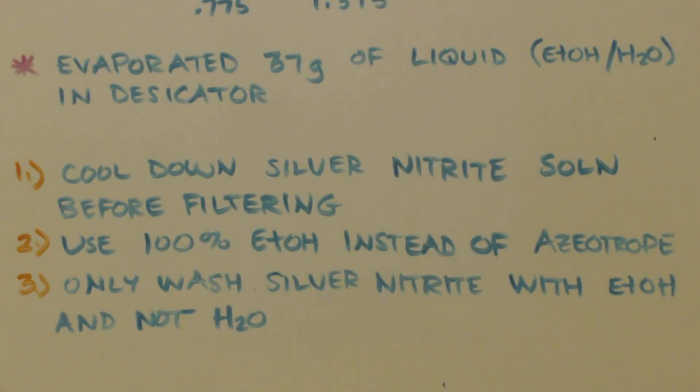Okay, now what would I do different about this to try to get more than 94% yield? Number one, I would cool down the silver nitrite solution before filtering it. Just to get as much precip out as I could, even though it's just a little bit. Second, I would use 100% ethanol instead of the azeotrope for the washings. And third, I would only wash with the silver nitrite with ethanol and not water. Remember, the first wash I used water, then I used two washes of ethanol. I would switch that to three washes of ethanol, pure ethanol, not azeotrope. And that's basically the only thing I would do different.